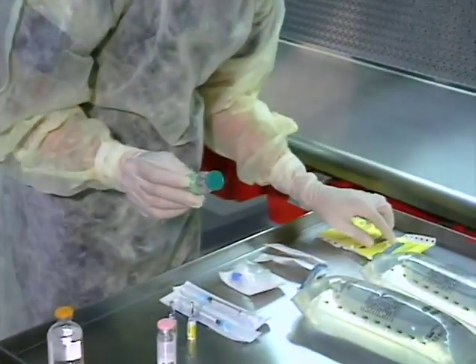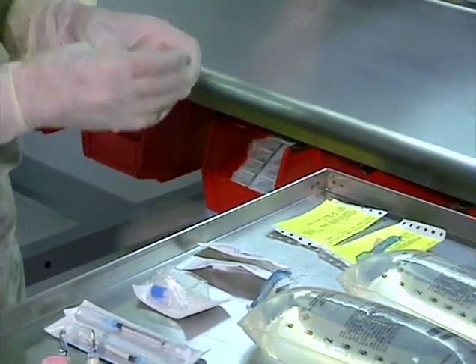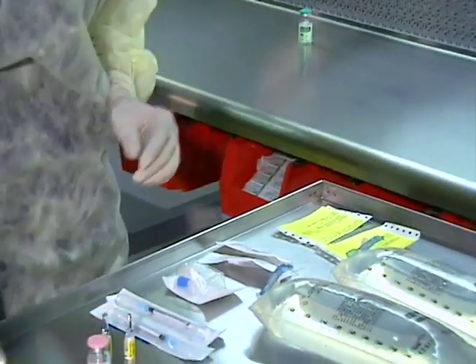Now examine the label of each additive. Compare the drug name and concentration to the order. Check the expiration date and transfer the item to the critical work surface.